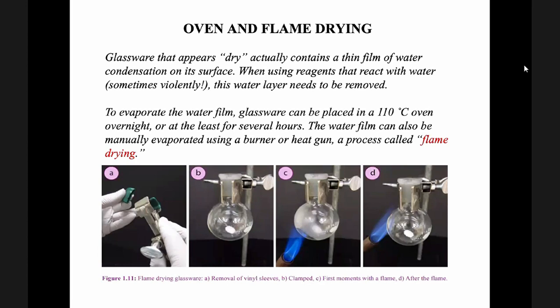Okay, so glassware that appears dry actually contains a thin film of water condensation on its surface. So when using reagents that react with water, this water layer needs to be removed. Kaya nga ang other reagents nga that will react with water sometimes creates violent reaction. So dapat wala na siya.